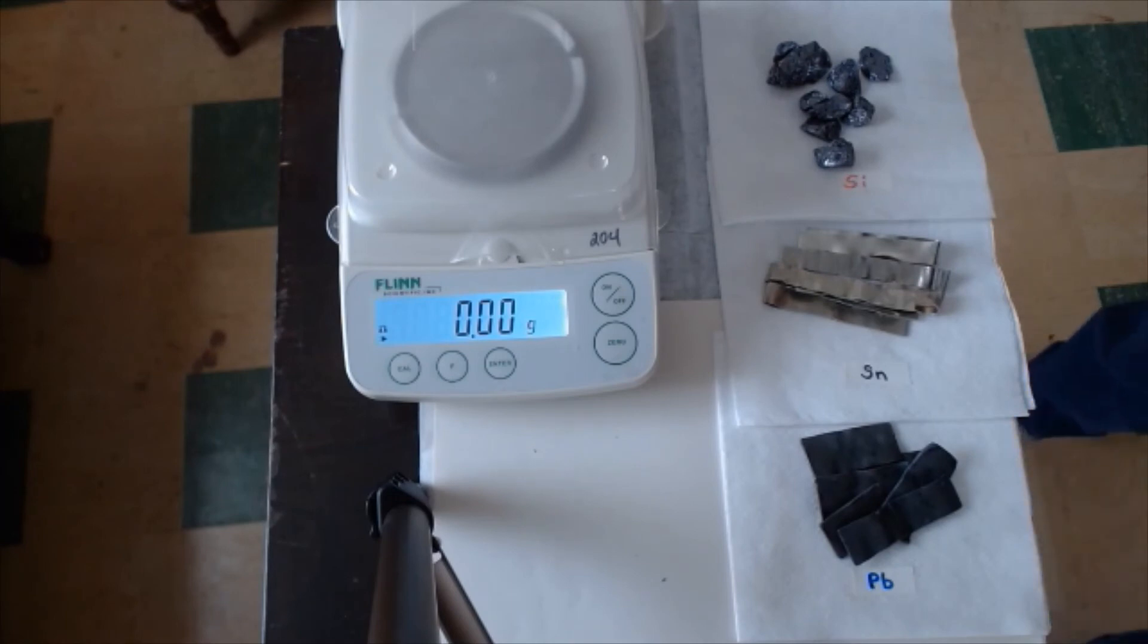Then for the analysis, what you're going to do is you're going to prepare a graph. We're going to look for a pattern. So you're going to be like Mendeleev or Lothar Meyer. You're going to look at the pattern. So you're going to make a graph of density versus period number. And it's always Y versus X. So density will be on the Y axis and the period number will be on the X axis.